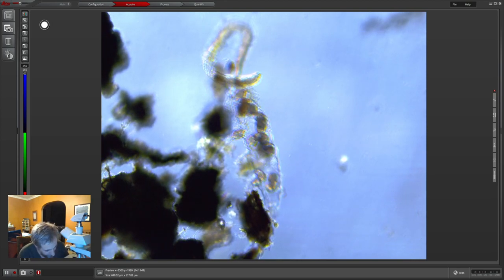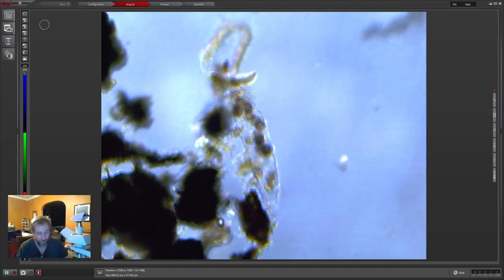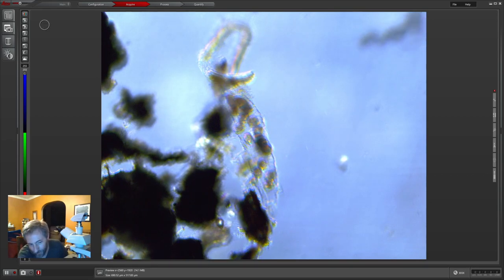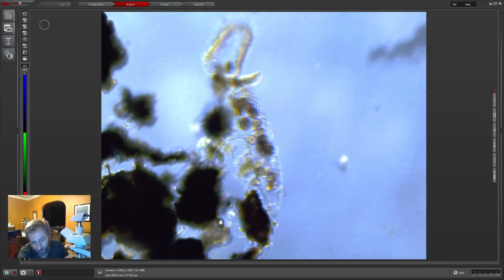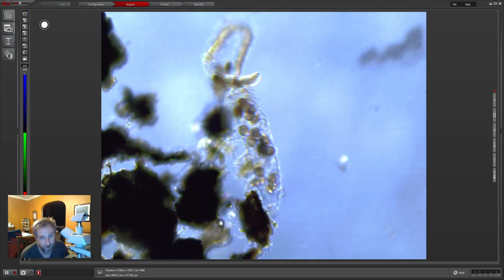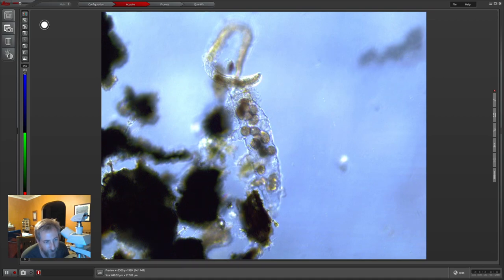Gooboo is still sitting here on this slide and hasn't moved. I keep gooboo in his own little slide — he just sits on it. We haven't rehydrated him in a while, so he's just kind of been hanging out there, probably in his dried-out state.